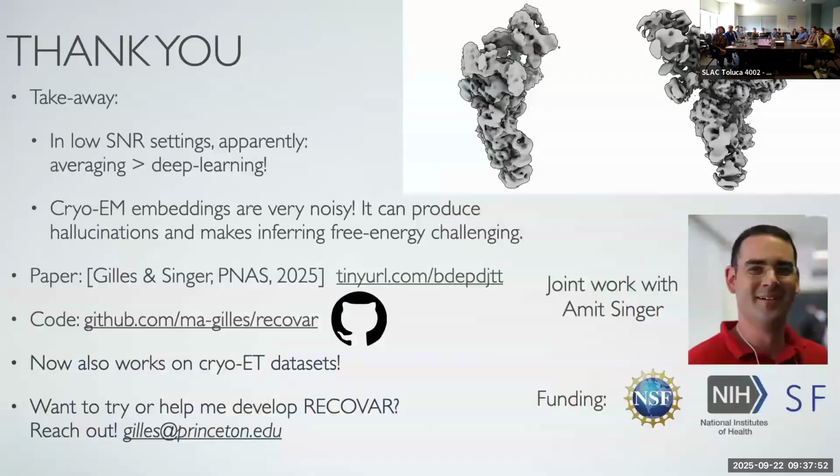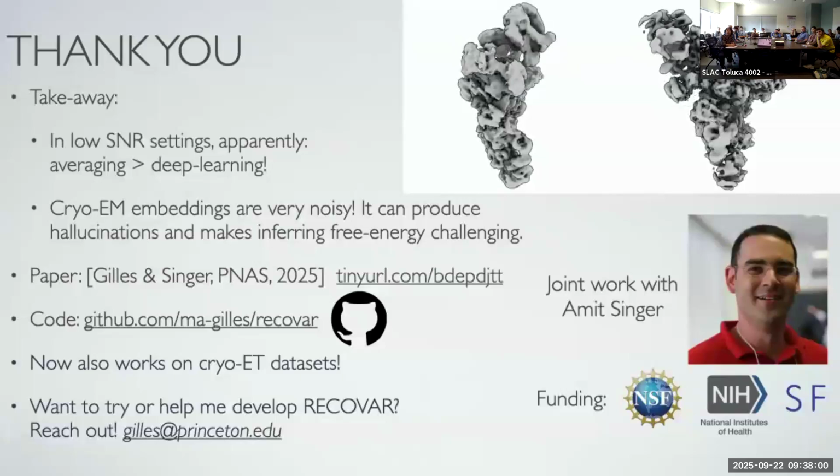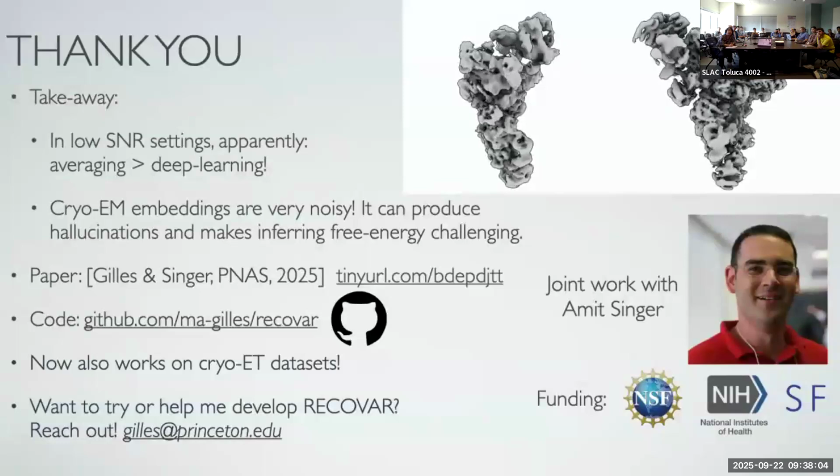Okay, so here are my takeaways. So in the low SNR settings of Cryo-EM, apparently, just averaging will outperform deep learning methods. And the Cryo-EM embeddings are very noisy, and we should be very careful about this because it can produce very believable hallucinations and can make inferring free energy or metastable states very challenging.